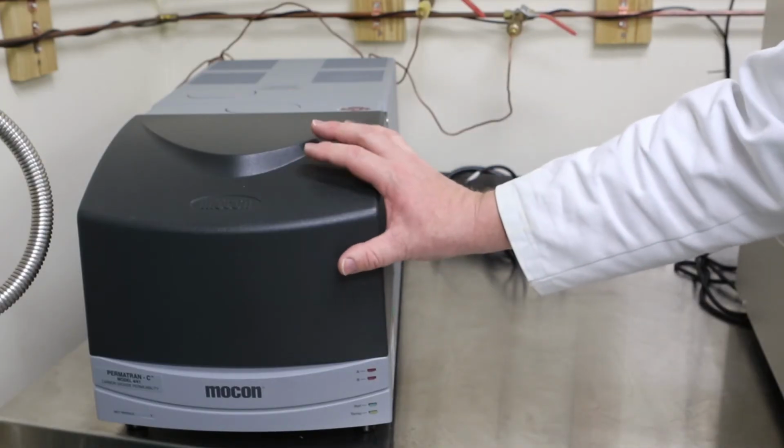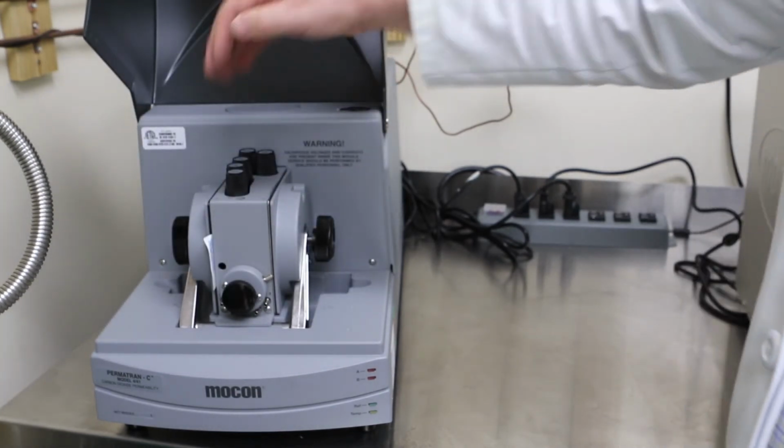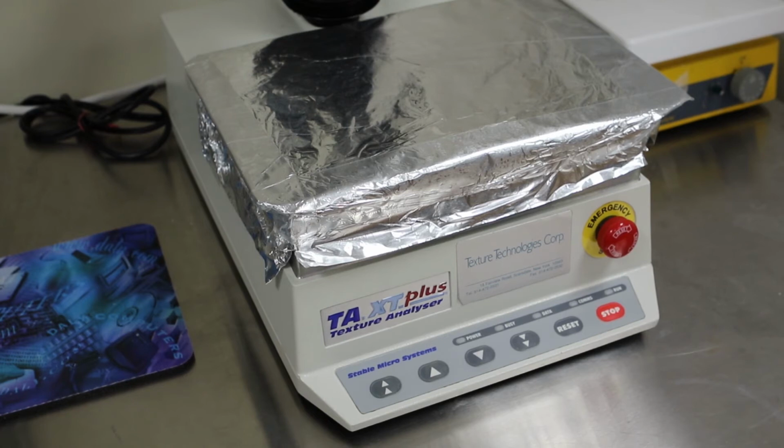We train them on a differential scanning calorimeter, which is another instrument for measuring thermal changes in a material as either it melts or as it recrystallizes, and how that process occurs. We train them on a texture analyzer.